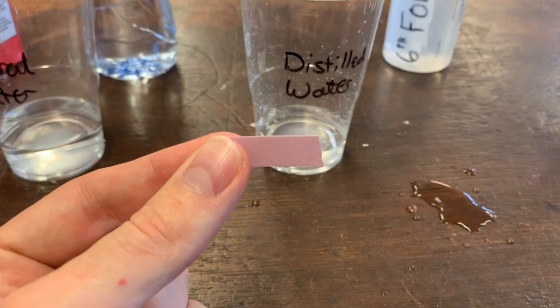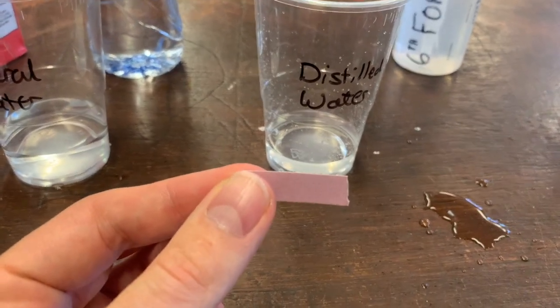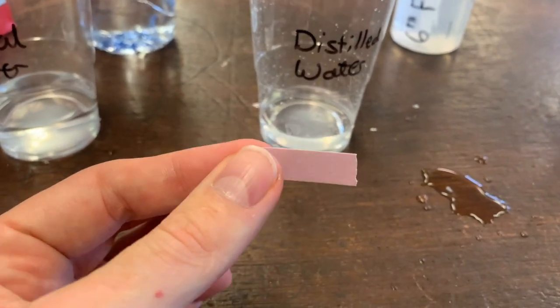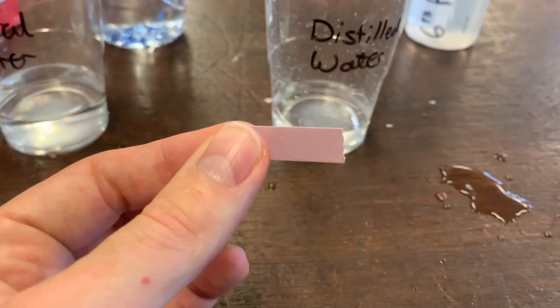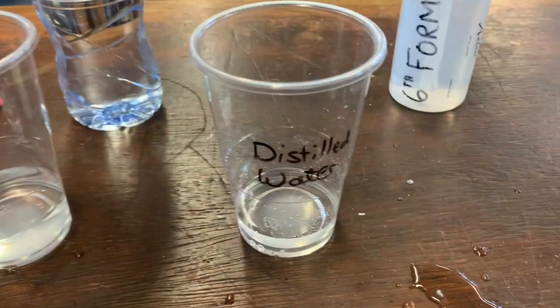So to test with litmus paper, what you do is you take the paper and just dip it in our sample of our liquid. If it is an acid, it will turn red. If it is a base or an alkali, it will turn blue. And if it's neutral, it will stay the same colour. So let's just test this distilled water.